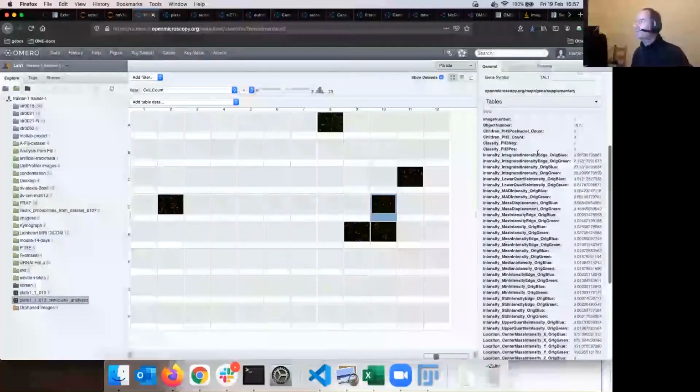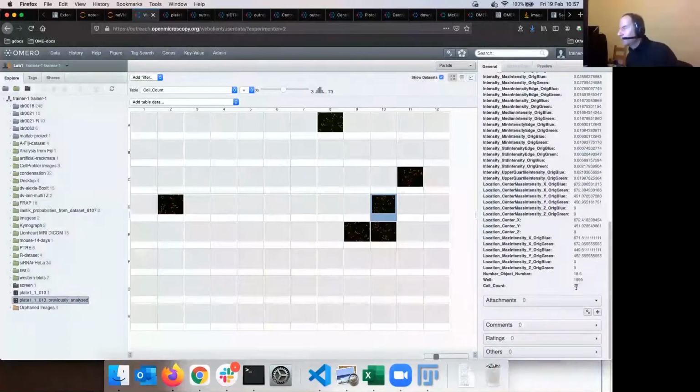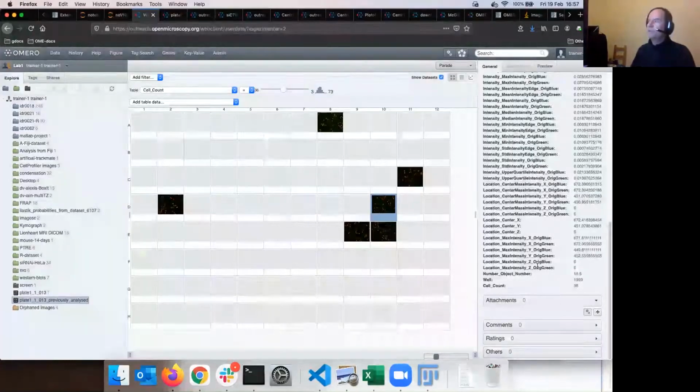And if I go in the OMERO tables harmonica, and look here, of course, the cell count says 36, because that is where OMERO.parade takes its wisdom from, from this OMERO table. Good. So this is so far for the OMERO table.